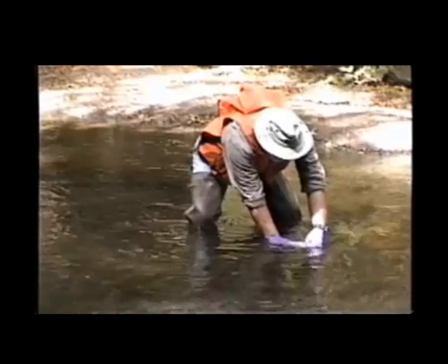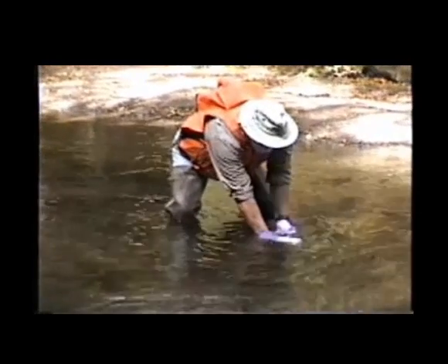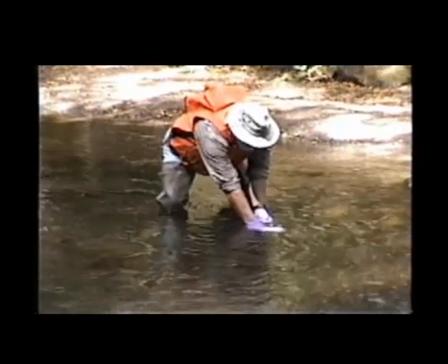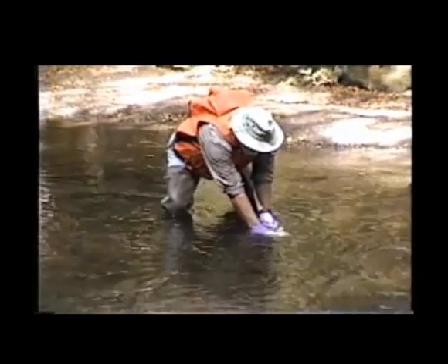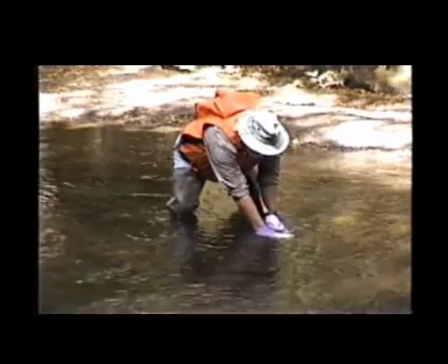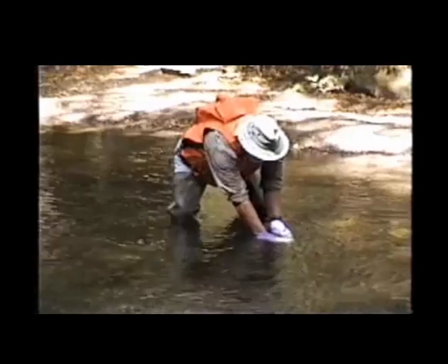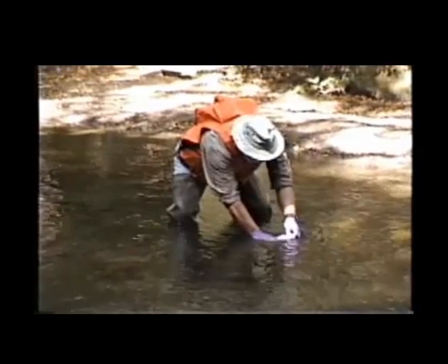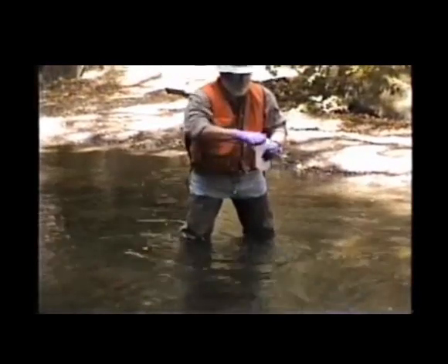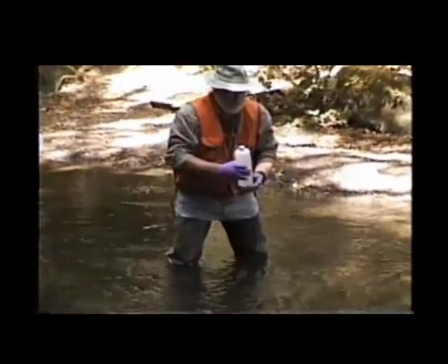Now the bottle is ready to be completely filled. Since this is an inorganic sample, we do not have to worry about headspace since there are no volatiles that will be analyzed in the inorganic sample. The bottle is then filled, and the sample is complete.